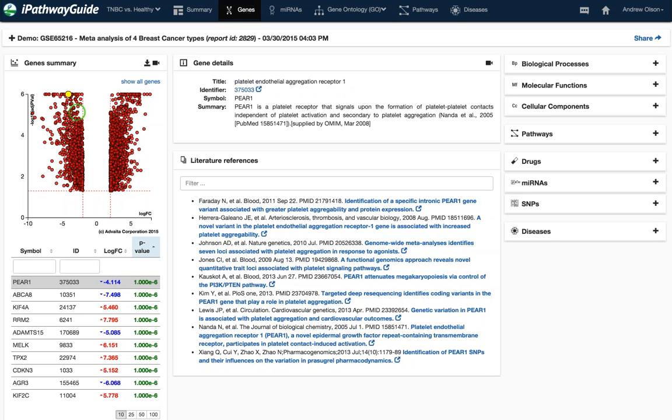And by default, we're only showing the significant genes. If I chose to show all genes, and I'm not going to do it here because it's going to load up 20,000 genes in this case, and it'll take forever on this webinar, you would get a list of all those genes, including the ones that were not significant, and then you would see values down here that are not bolded and not green. So I think that answers that question.